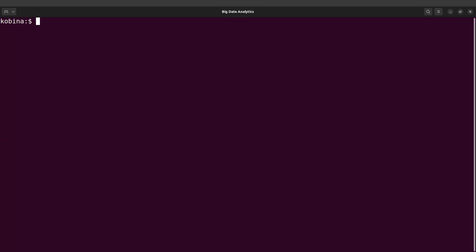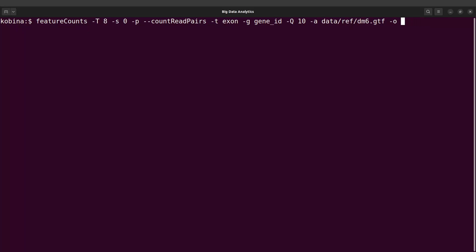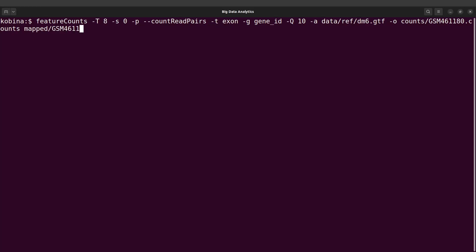Let's clear the screen and run featureCounts for the other sample. I'll recall the featureCounts command for the first sample. Since we are now going to run for sample 1180, the -o output will change and the input file will change. All other options remain the same. For output, I'll say counts/gsm461180.counts, and the input will be mapped/gsm461180.